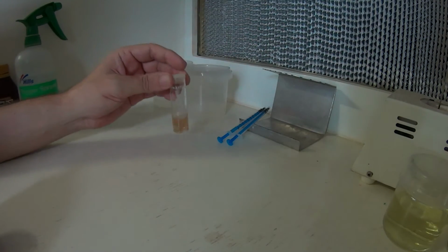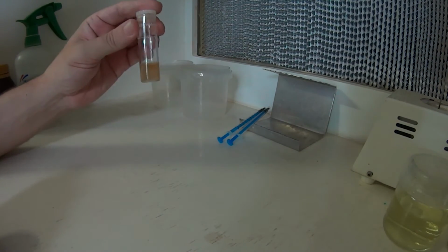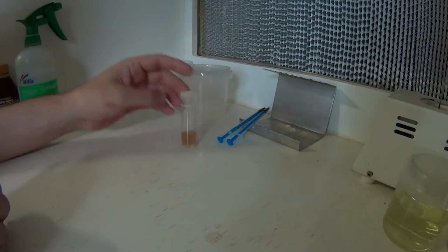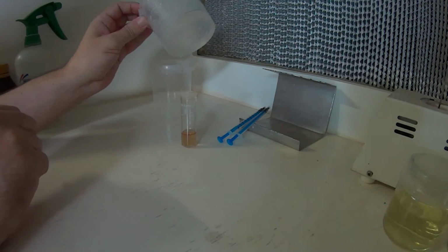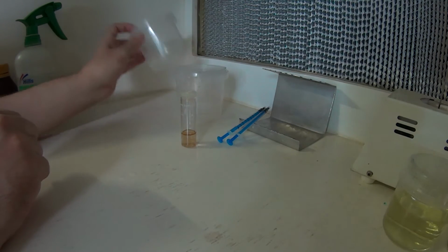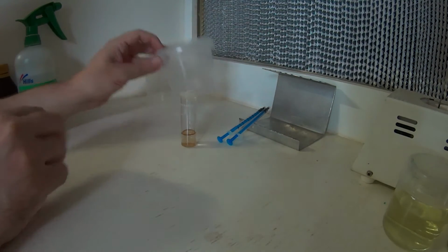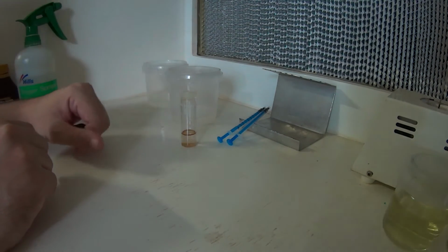Alright, the orchid seeds have had a fair bit of time now to soak. As you'll notice, it floats to the surface, so when we go to suck it up with our syringe, we'll need to keep it a little bit agitated so we can actually get some of that seed in there. Also, with your containers, because you're adding a little bit of fluid to them, try and drain out as much of the condensation as possible beforehand, which I've already done to these. It's always still going to be a bit in there, it's hard to get it all out, but try and get as much out as you can. Otherwise, your orchid seeds tend to be floating around on the surface there, and that doesn't tend to work real well.